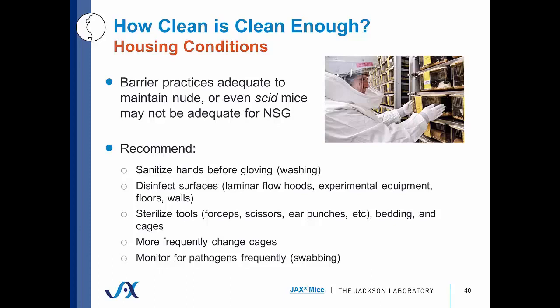Also, disinfect surfaces such as laminar flow hoods, experimental equipment, floors and walls, anything that the NSG mice will be coming in contact with. Also, sterilize any tools, including forceps, scissors, ear punches, as well as bedding and cages. We also highly recommend changing cages more frequently and monitoring for pathogens more frequently by swabbing and using sentinel mice.